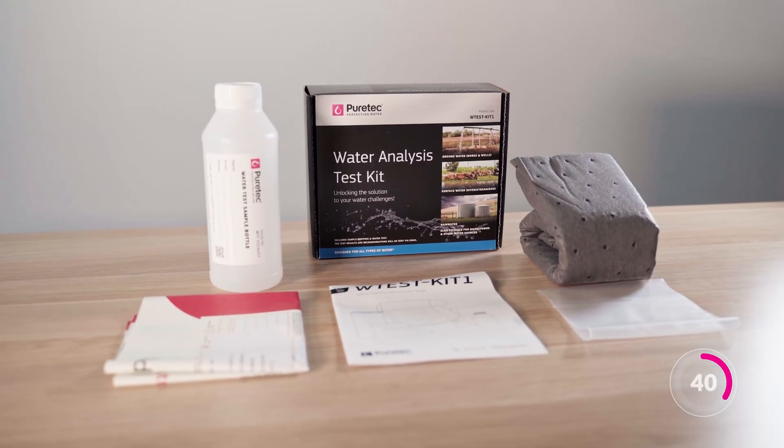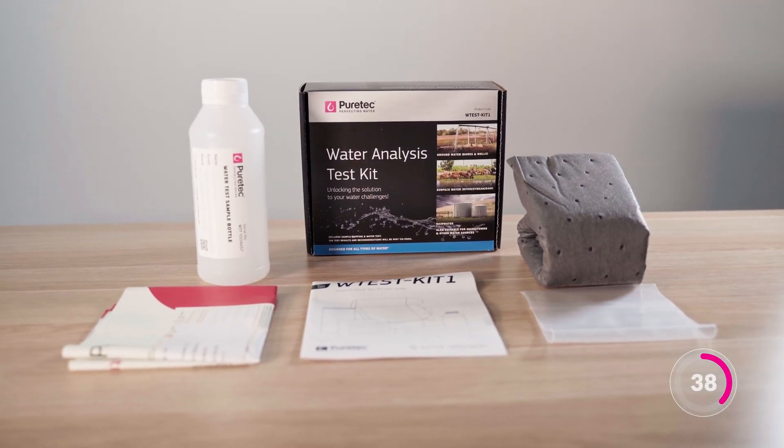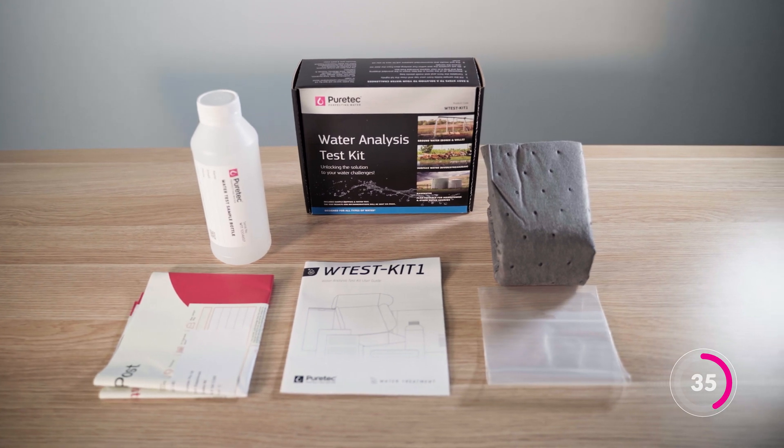You can pick up a kit from your nearest PureTech dealer. The kit provides everything you need and tests the most common non-bacteria contaminants from different water sources.